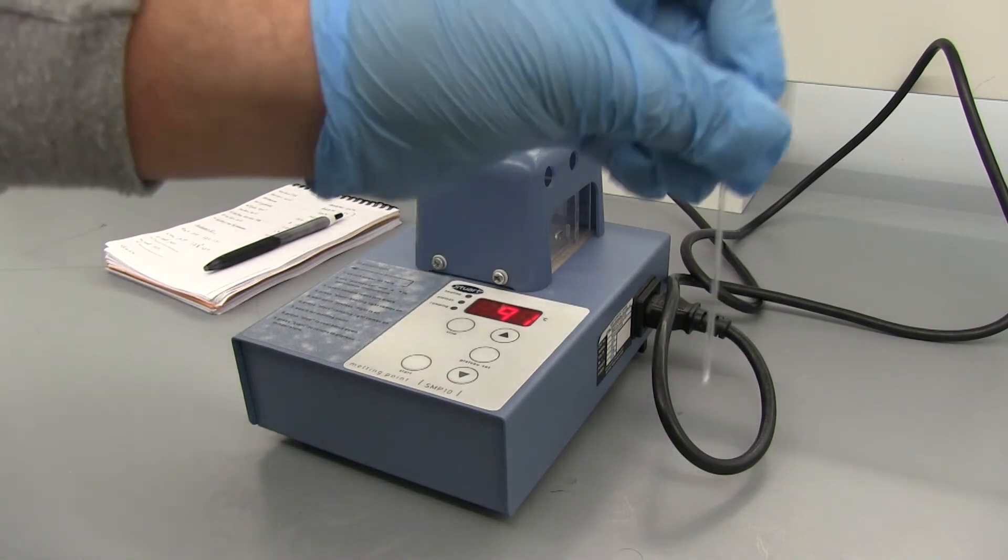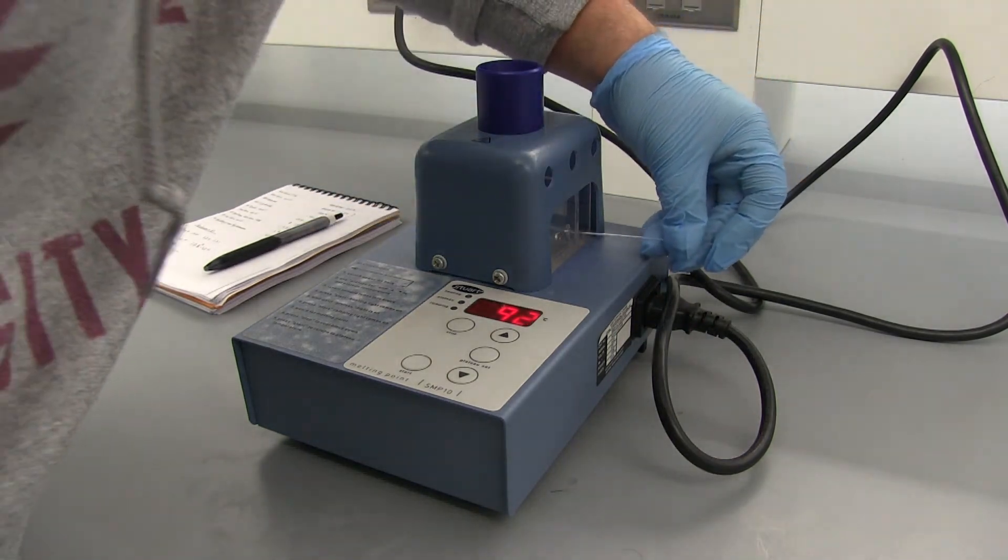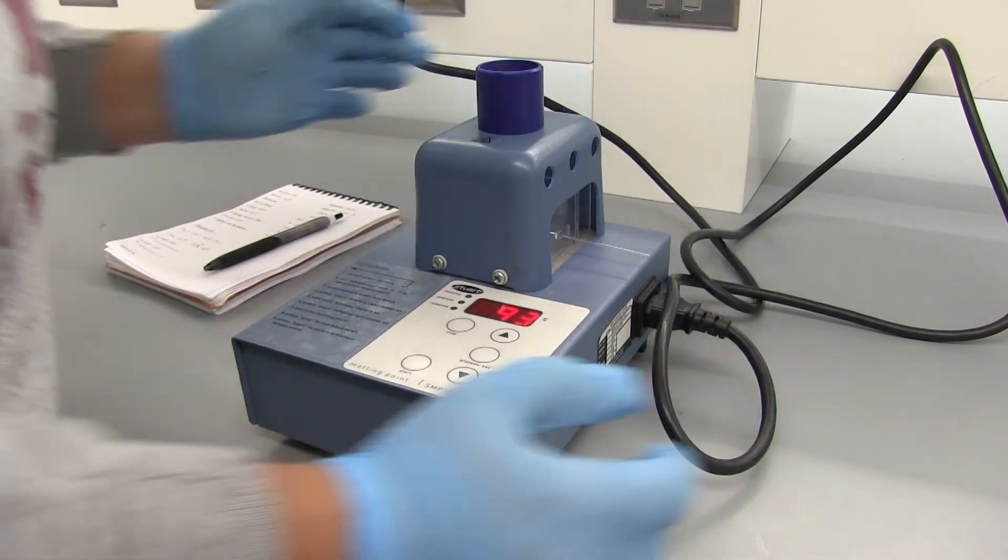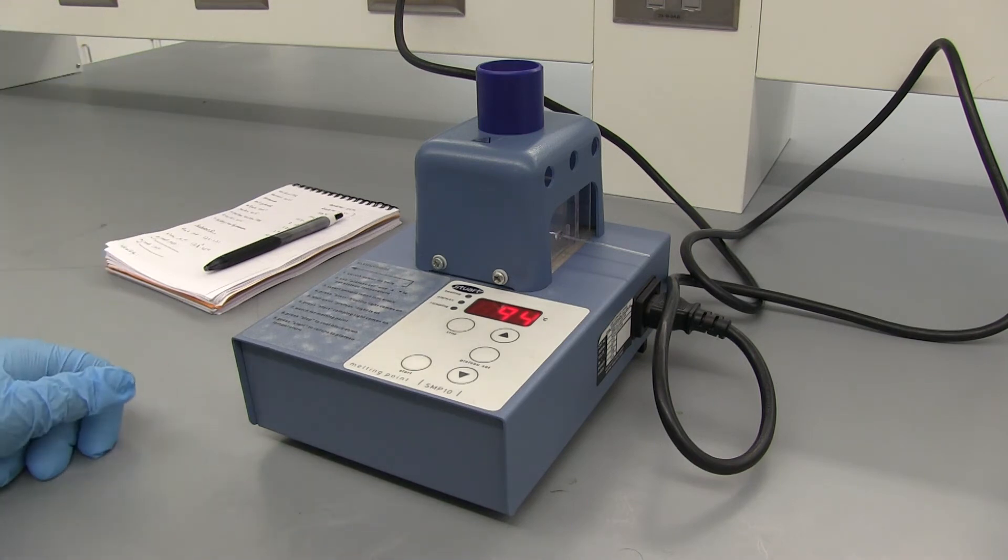Alright so I've got a mixture of benzoic acid and unknown D. We'll go ahead and put it in. If it's the same compound and the identity is benzoic acid we'll see that we get the same melting point. If it's not the same compound we'll get a lower and widened melting point.